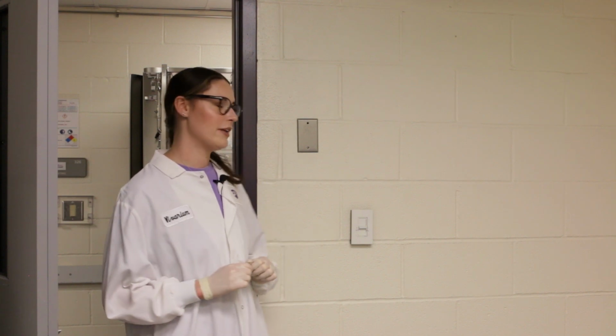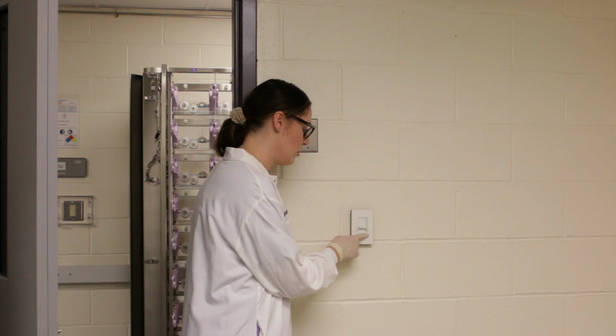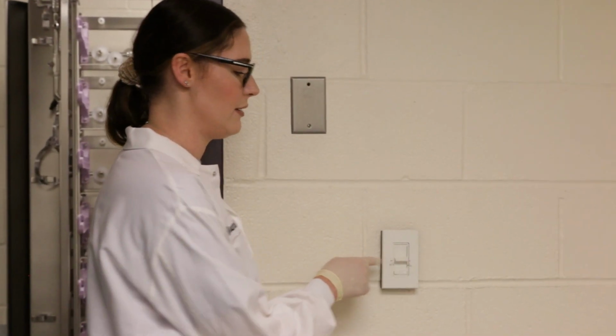Prior to running the behavioral task, we need to do a few things in the room. First, we're going to use a white noise generator. We usually keep that in our other behavior room, but you can bring it in and turn it on. Additionally, we have different lighting for this behavioral task, and we have indicated that the Elevated Zero lighting is correct if you just turn on the switch and keep it here. And during the test, we're actually going to turn off the lights in the room.